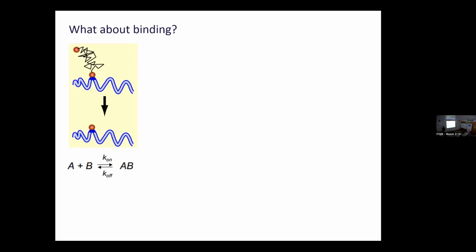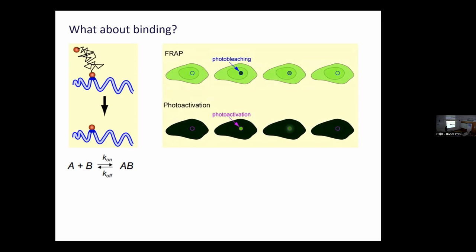No, because both techniques, I mean, you are perturbing a steady state where they are binding and unbinding, they're always doing that. You're changing the emission or lack of emission of just a few of them, but what you are measuring is always the same dynamic process of binding and unbinding. Molecules cannot bind to a binding site if the molecule that's already there doesn't unbind first.